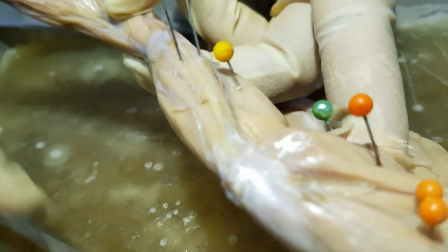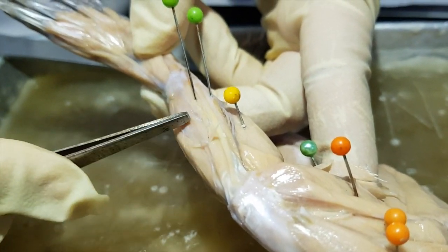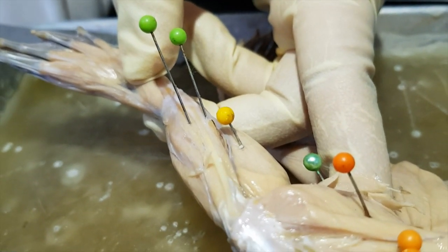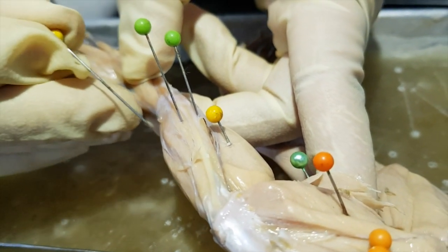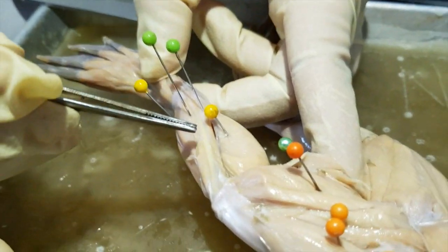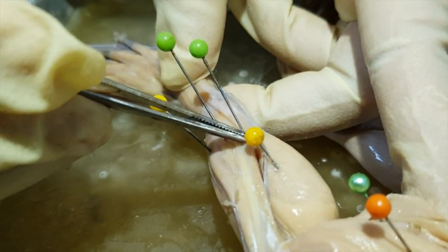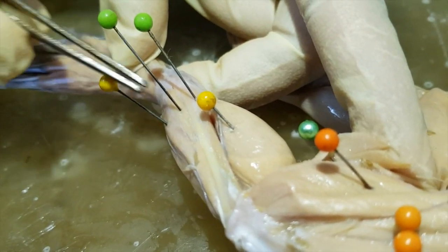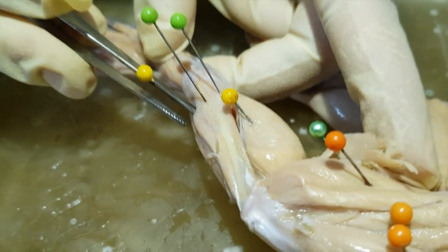And this muscle on the posterior side, on the side of the extensor cruris, is the tibialis anterior. So the basis is the tibia bone. In between is tibialis posterior. This is the tibia bone, this is extensor cruris, and then this is tibialis anterior. Okay?